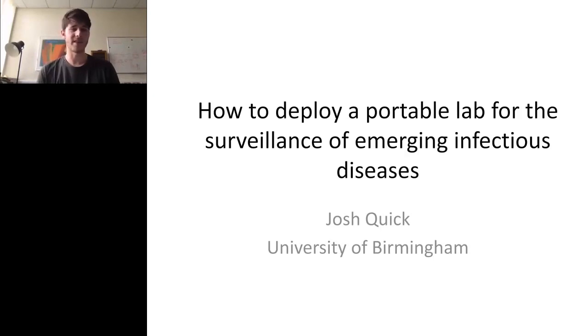In this particular talk, I'm going to be talking about two viral epidemics, which you will definitely have heard of. The first is the Ebola outbreak in West Africa, and the second one is the Zika outbreak in South America. And we used portable genomics and surveillance, as we call it, which is the term I'm using to refer to when you know that something is there and you want to keep an eye on it rather than trying to find something new. And that is what we did in those countries.